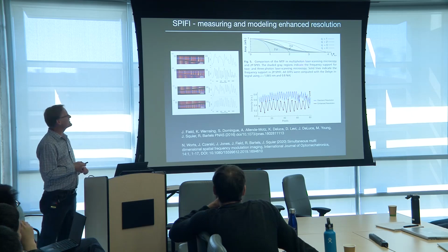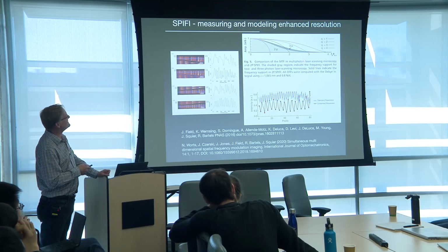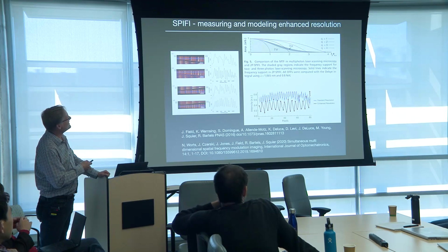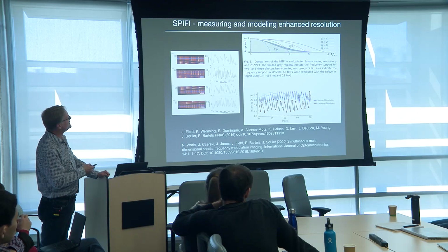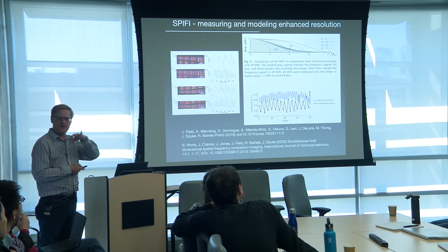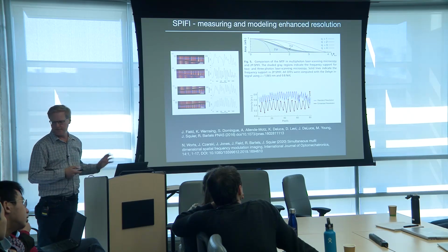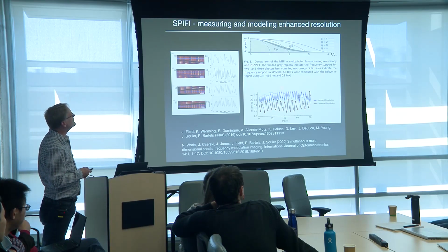So okay, so this kind of gets so now. Yeah, so here's where we've actually plotted the OTFs for SPIFFI along these lines, and now we can really compare it for 2-photon and 3-photon. And my hope is that it really seems to make a difference, and hopefully in understanding your images when you really do start to, so your cutoff frequencies are the same, but look, you really are gaining this more bandwidth towards those cutoff frequencies. So I think it could have a real impact there.